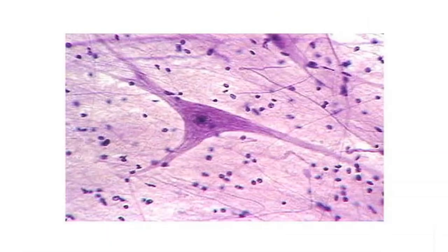Here we have, you tell me, what do we have? Looks like a kite flying in the sky. It's our classic nervous system tissue. So there's a neuron, there's the cell body, here's the axon coming out behind it. These here are probably dendrites of the neuron. And then these little boogers out here are support cells called glia or neuroglia. So this is nervous tissue. And this is all we talked about in our lecture, the neuron and the neuroglial support. Where would we find it? Brain, spinal cord, peripheral nerves.